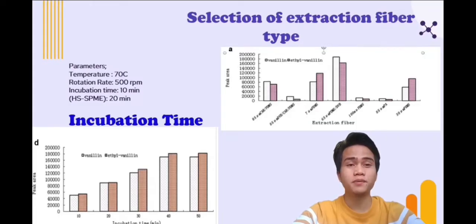Faiz and I'm going to explain about the result and discussion. The experiment was conducted under the following parameters where the temperature at 70 degrees, oscillator rotation rate at 500 rpm, incubation time for 10 minutes and headspace solid phase micro-extraction time for 20 minutes.